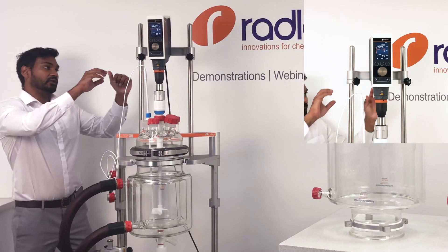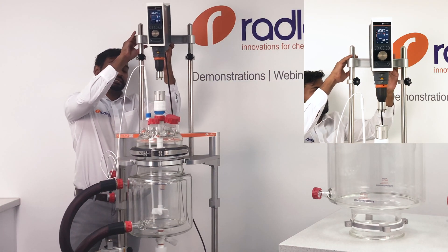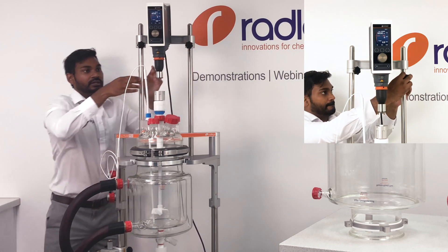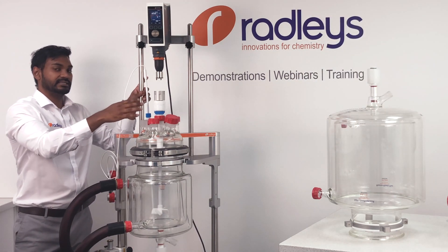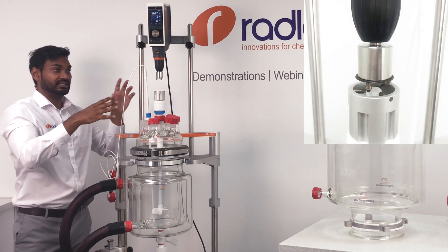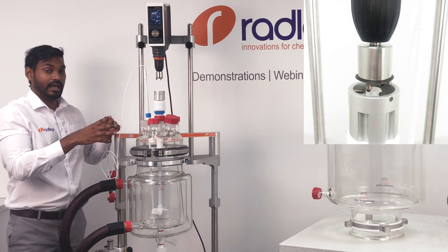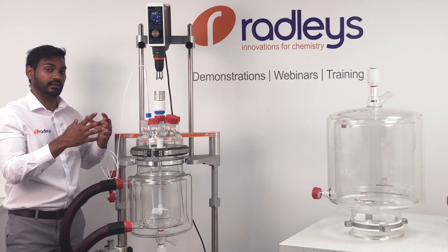First, we're going to lift the overhead stirrer up using the I-beam, which takes the weight of the overhead stirrer, and we can secure it using two safety collars. You can see that the overhead stirrer is not connected directly to the impeller — instead we have a patented drop-in coupling which sits inside the stirrer guide. This ensures that the weight of the overhead stirrer is not transferred through to the lid of the vessel, minimizing the risk of the lid breaking due to stirrer misalignment.